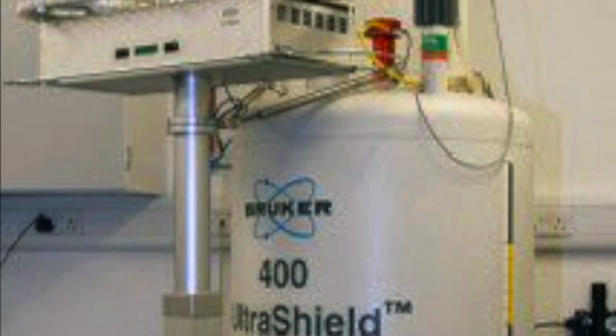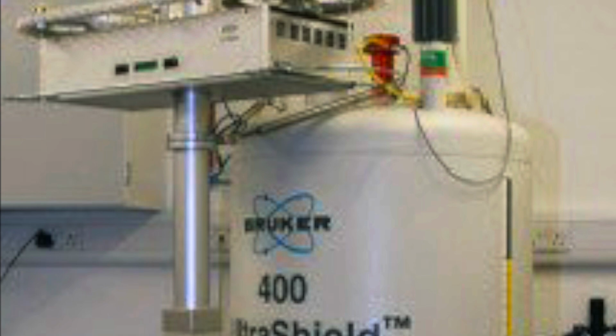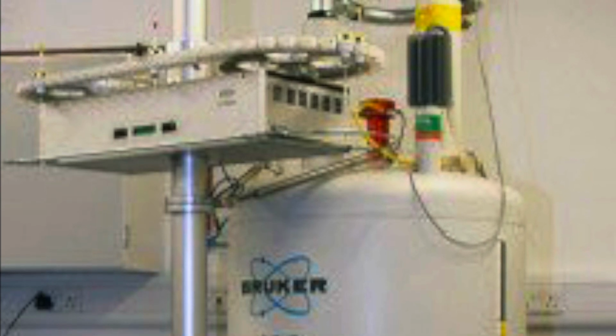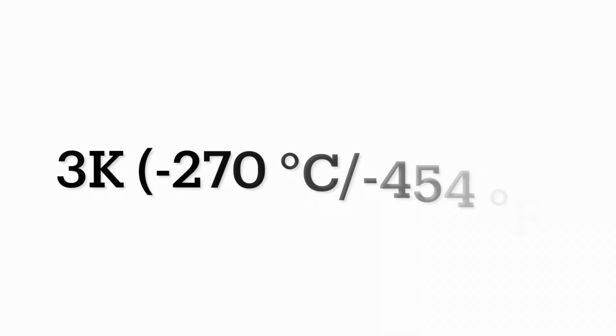So you take your sample and you bung it in a strong permanent magnetic field. And when I say strong, we're talking 20 Teslas. When I went to Queen Mary's University, they had one of these, and they had a massive line all the way around the building where you could not step in because it would literally just pull you in or interfere with your phone. And the samples need to be kept in extreme conditions.